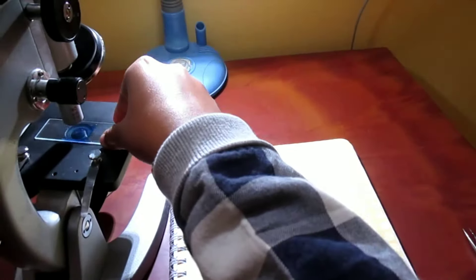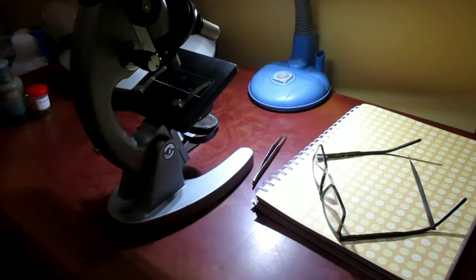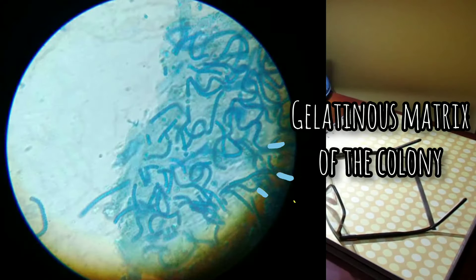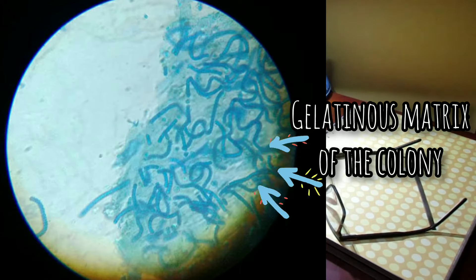What I have got here is a filamentous form. The filaments are aggregated together within mucilage envelope forming ball-like gelatinous colonies which is termed as Nostoc balls. Each trichome is enveloped by a thin mucilaginous hyaline or colored sheath forming a filament.